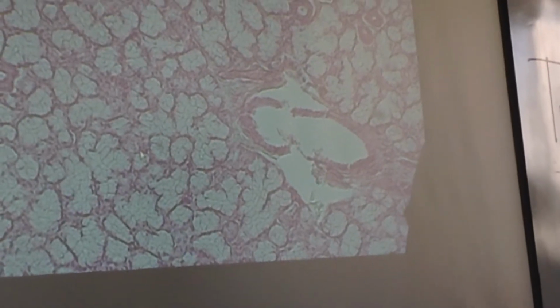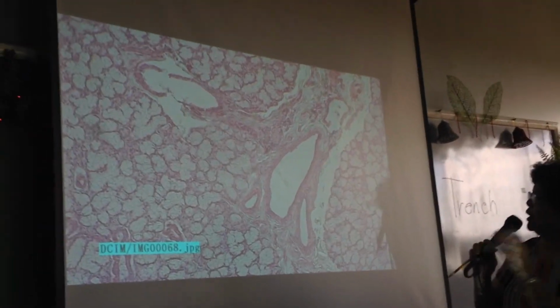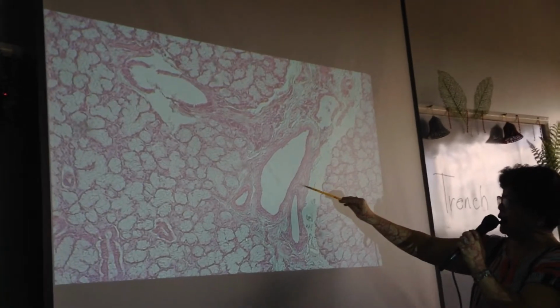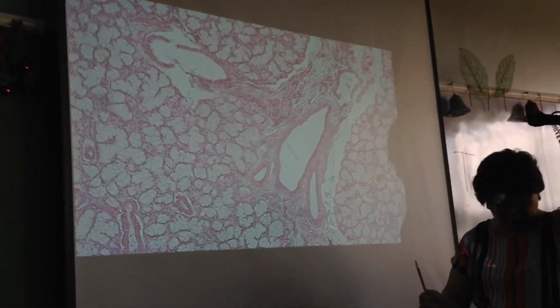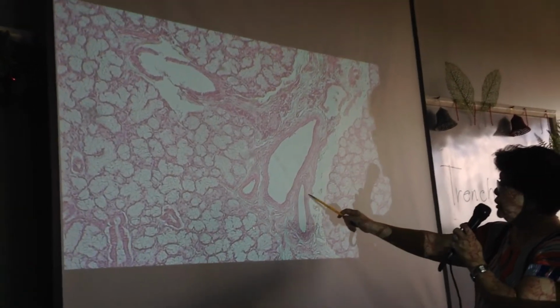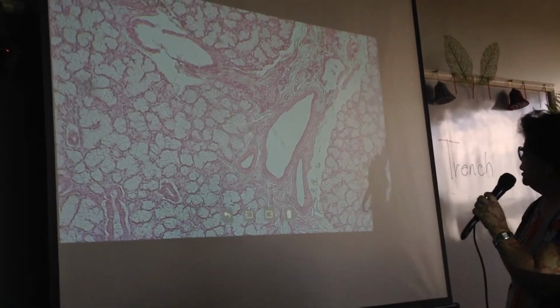Is that clear? Okay, next. This is again the interlobular duct.